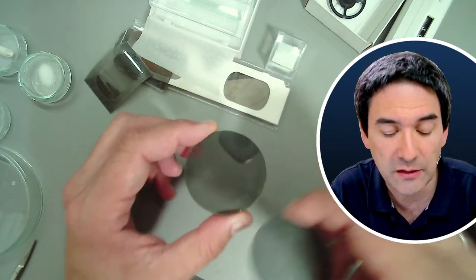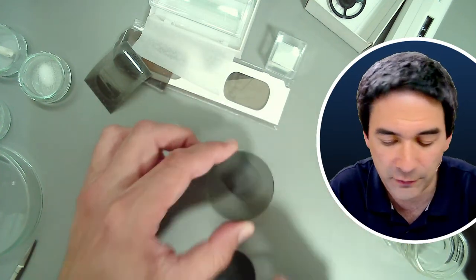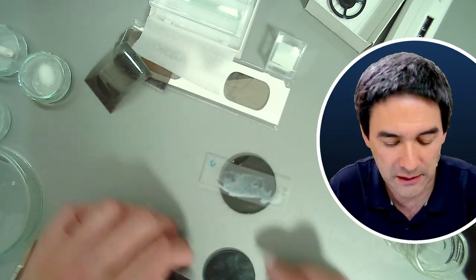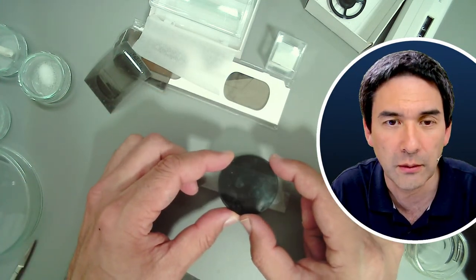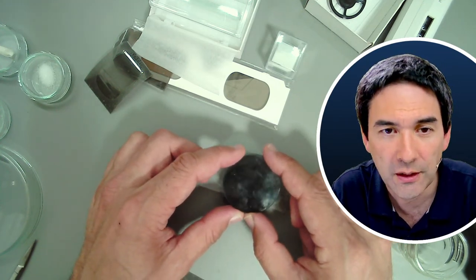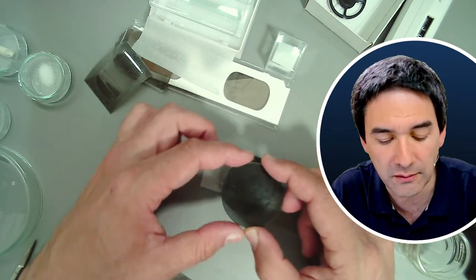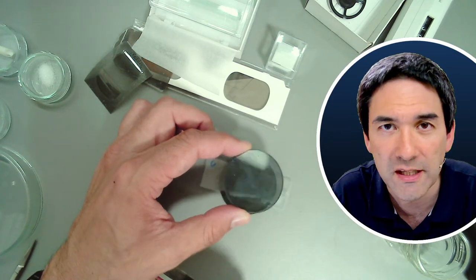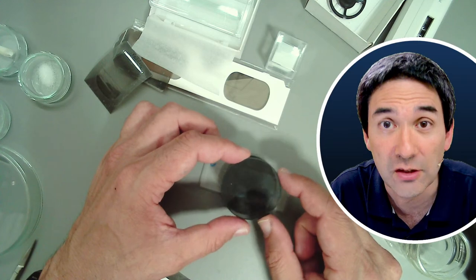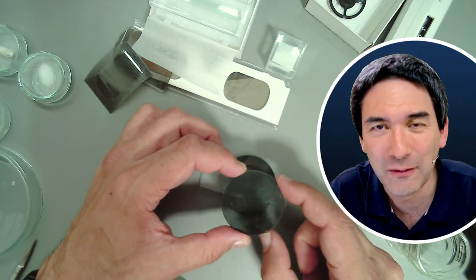So what we need to do is put a filter on the bottom with light from the bottom. Then we need to put a slide on top, like I've got some prepared slides here, and then we need to put another filter over the top here. And usually with compound microscopes, there is not a lot of space between the objective and the filter. That's why I'll be using a stereo microscope today to show you that this is also possible.